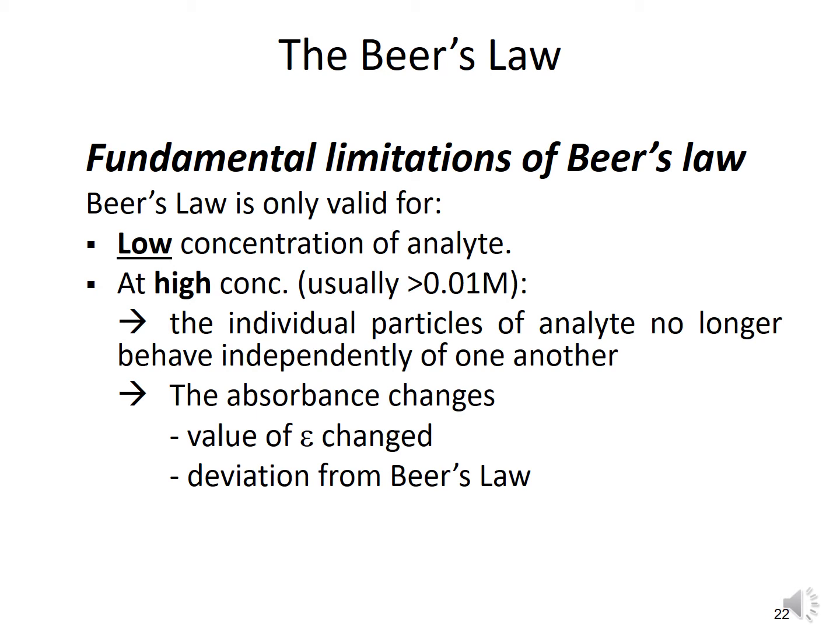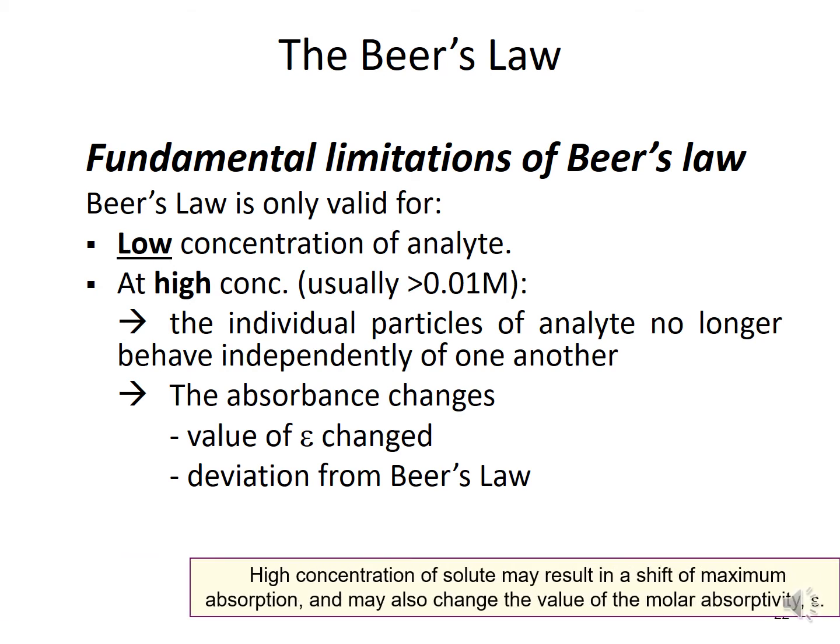So the individual particles of analyte no longer behave independently of one another. So this is the reason why at a high concentration, the Beer's law is not suggested to be followed, and the value of absorbance or absorptivity changes.